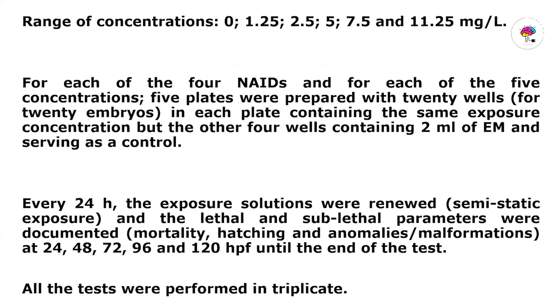To assess the acute toxicity of diclofenac, ibuprofen, ketoprofen, and paracetamol, we used a range of 5 concentrations. Every day, the exposure solution were renewed, and the lethal and sublethal parameters were documented as mortality, hatching, and malformation until the end of the test. All the tests are performed in triplicates.